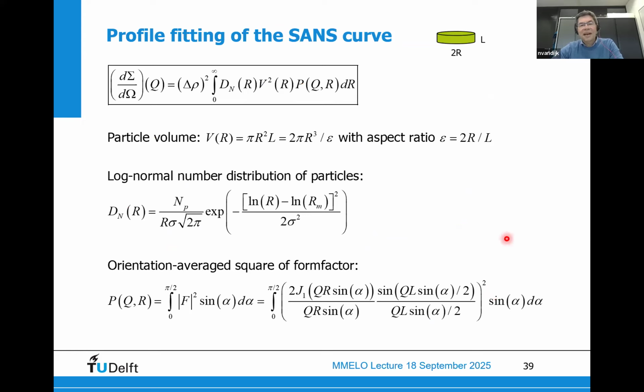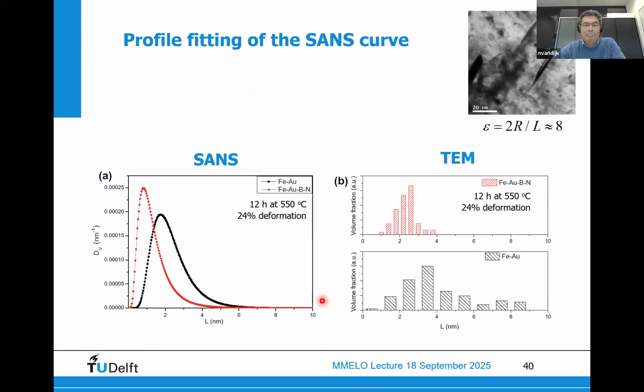So the analysis for anisotropic particles that are randomly distributed in orientation is now a bit different, because you need to adopt a certain aspect ratio for 2 sizes, and the scattering pattern is much more complicated, but all that is done in fitting programs which help you to analyze this. So that now allows you to get the particle size distribution also as a function of time.